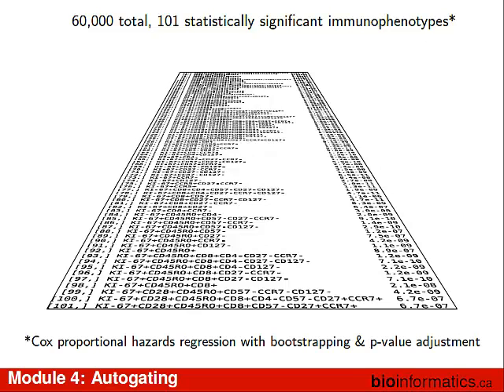And you can see, there's a lot here with a KI67. So then here's a whole bunch. No, you can't see it. I can because I'm standing right next to it. There's KI67 positive, and there's some that are CD8, and some that are CD45, and CD28. But here's the CD45 over here, and here's the CD45 over there. And it was really hard to figure it out.